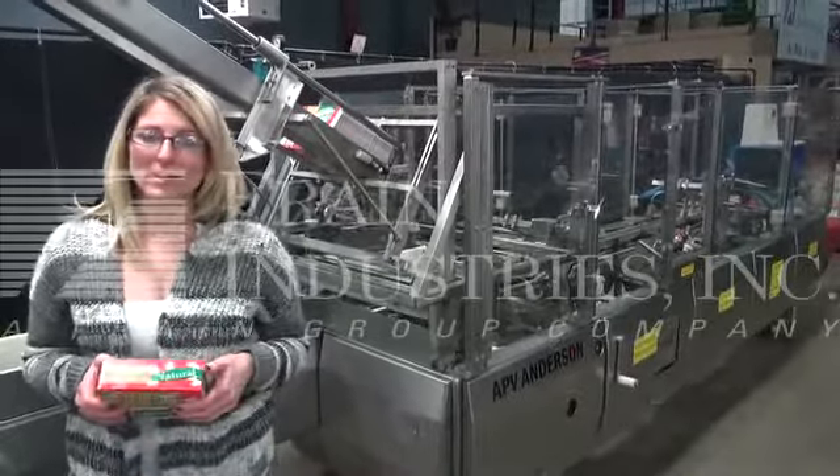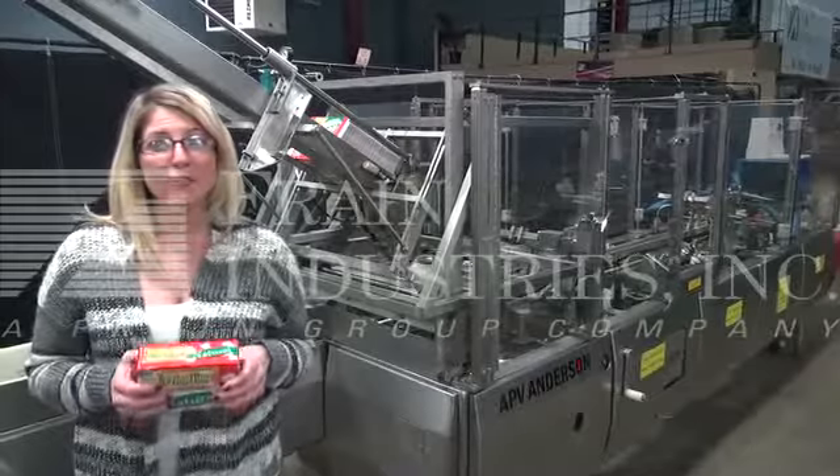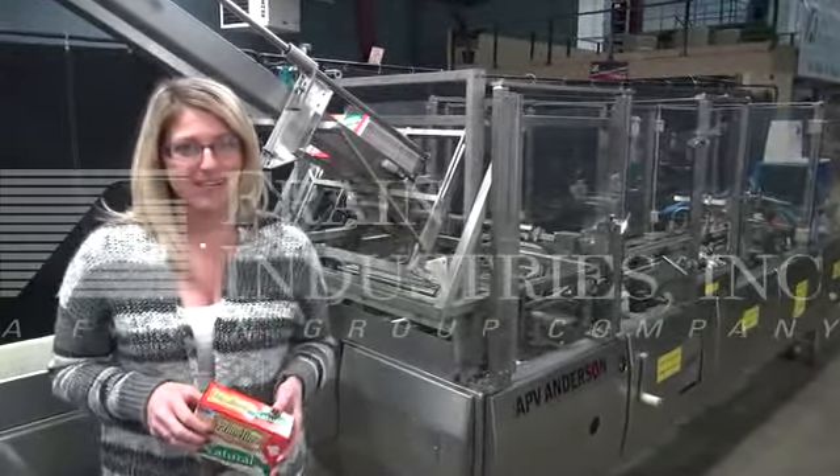We recommend you read the manual in its entirety before powering up the machine. The voltage is currently set at 3 phase, 240 volts. Today we'll be running this carton at 40 cartons per minute.